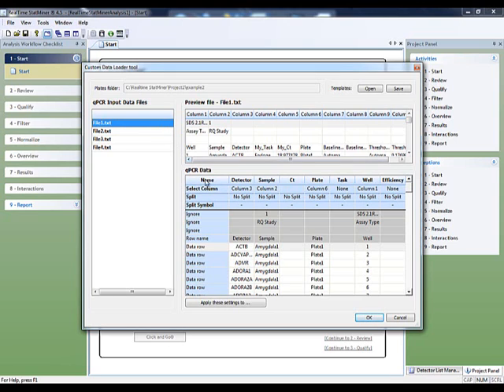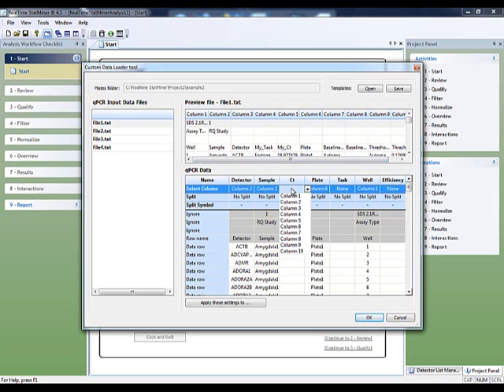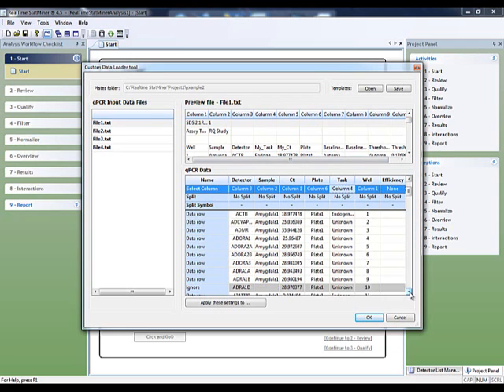As we can see, respective columns for detector and sample names have been properly detected, but there is an unknown column name identifier in case of CT and task columns. We only need to select the appropriate column on each case and we are ready to recognize this file. It is important to know that those entries with a missing sample or detector name will be ignored by default.